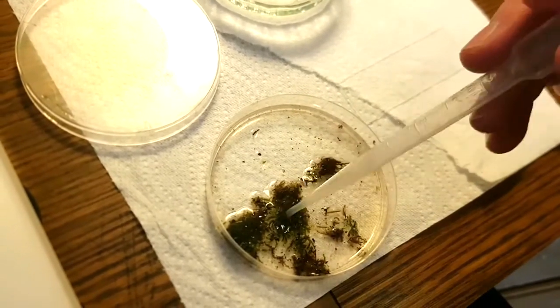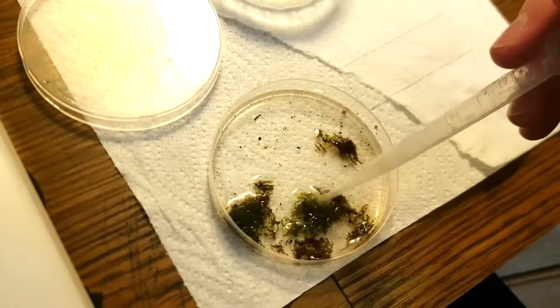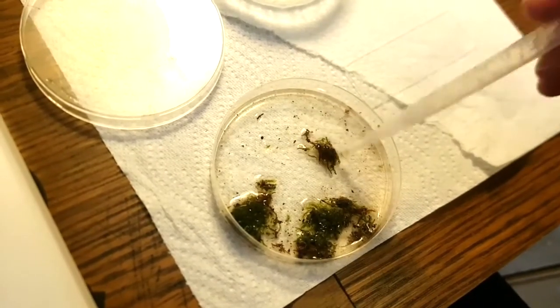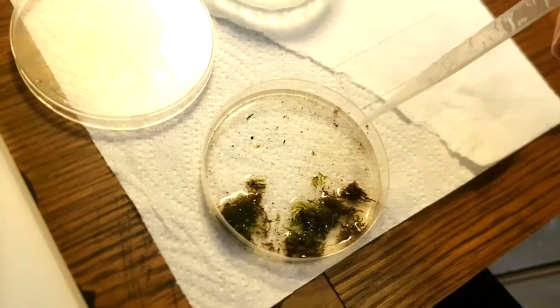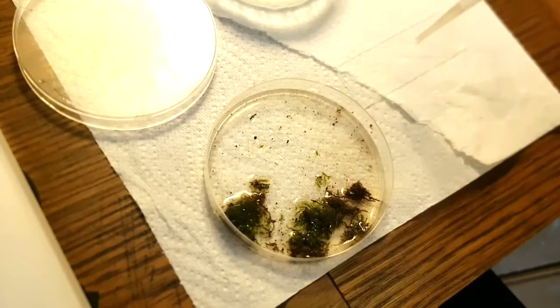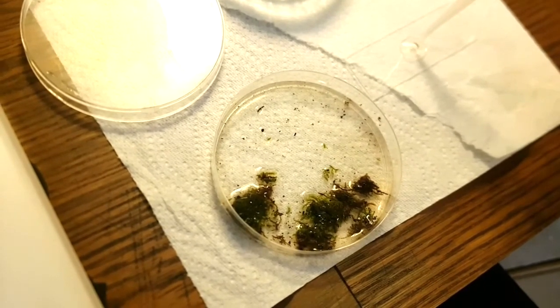I will keep going. There's still quite a bit of liquid in here, and I keep tapping the moss so that we can tap anything off that might be lurking. So I'm just going to keep going through this sample, and if I see anything interesting, I will hit record on the camera on top of the microscope.